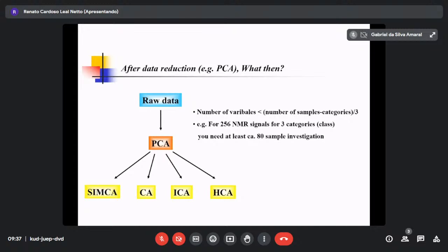You also can use PCA to check the quality assurance of your data processing, as you mentioned, to see the quality and the replicates. So it's also used for that. This is a good question. PCA has many applications. Now you have a triplicate, and also a QC sample.